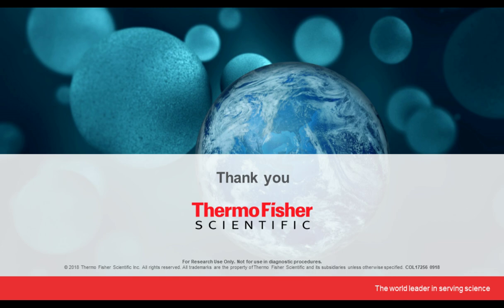That's a really good question. We have spent a lot of time understanding the quantitation of these phosphorylated forms of targets using the phosphopeptide. The challenge we see is that a lot of times the phosphopeptides, analytically, are not really good for quantitation. So to answer the question, we use the antibody that is specific for the phosphorylated form of the target, but after the enrichment and digestion, we spike in the non-modified version of the unique peptides for each one of these targets. So we don't use the phosphopeptide for quantitation.